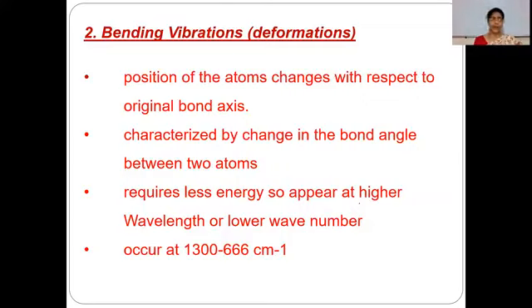Bending vibrations require less energy as compared to stretching vibrations. So they appear at higher wavelength or lower wave number. It shows absorption at 1300 to 666 centimeter inverse.